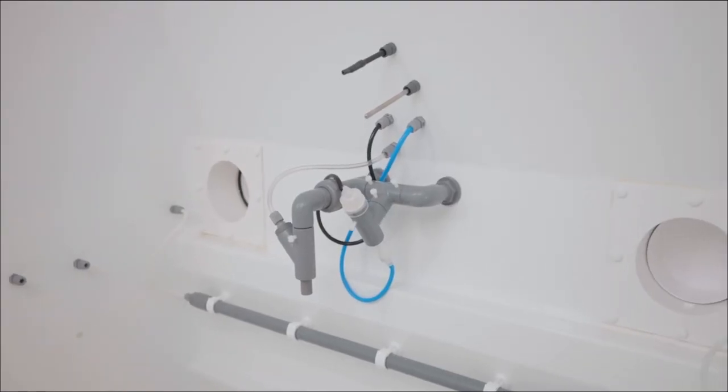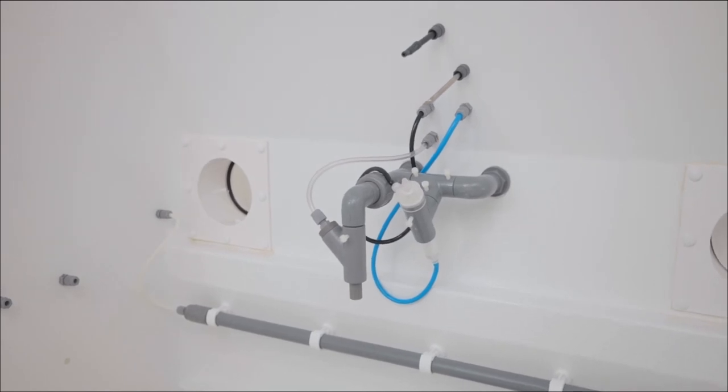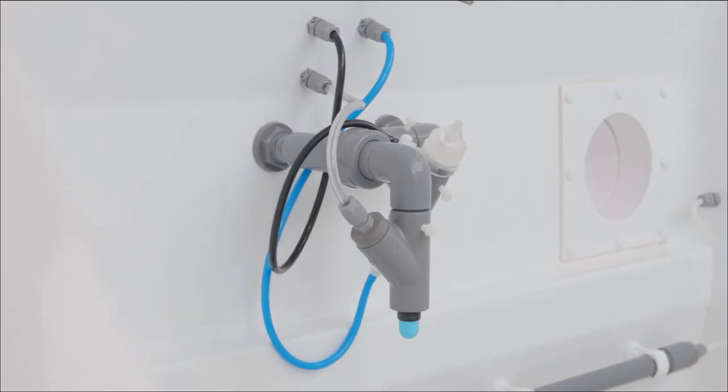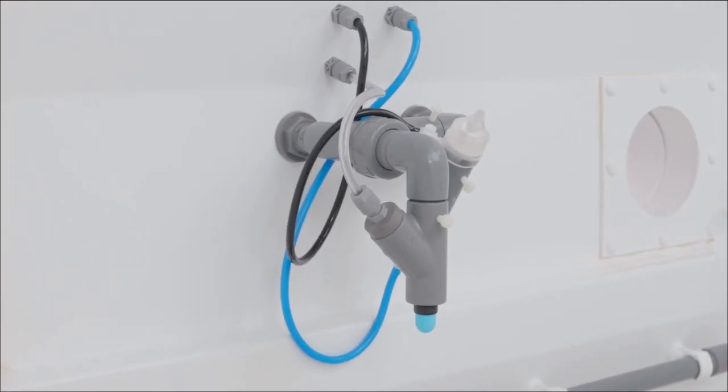At the rear of the chamber we have temperature probes for safety and temperature control of the chamber. We have our salt spray atomizer for generation of salt fog.